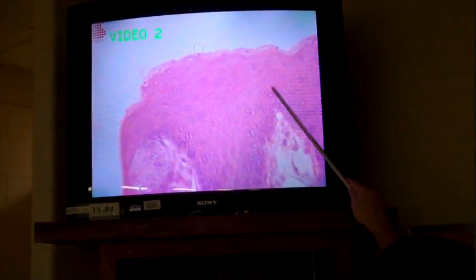If we go to the top layer of tissue, if we go from the connective tissue here up, we notice that we're dealing with very flat cells, and we notice that there are multiple layers of flat cells. This is stratified squamous epithelium. So this is what we expect to find across the top layer of the tongue. How is this different from the tissue that we find in the skin? It's not keratinized. That's the big difference. So we have stratified squamous epithelium there.